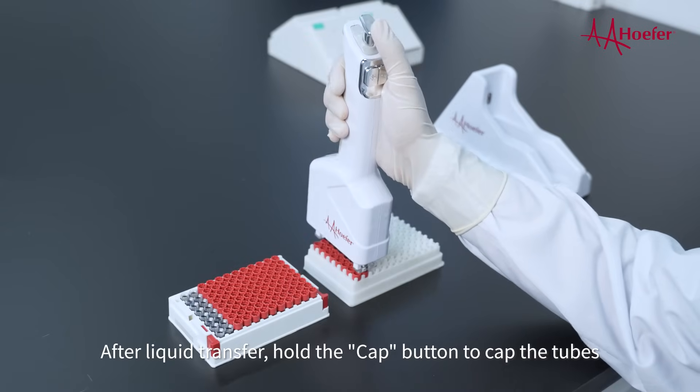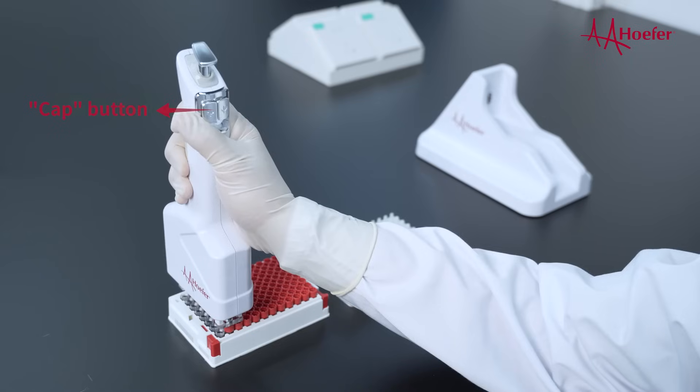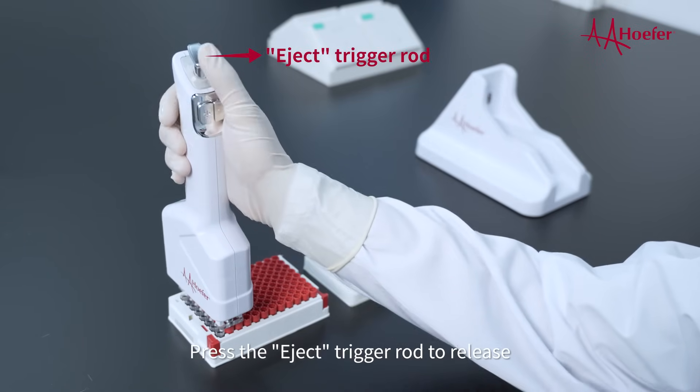After liquid transfer, hold the cap button to cap the tubes. Press the eject trigger rod to release.